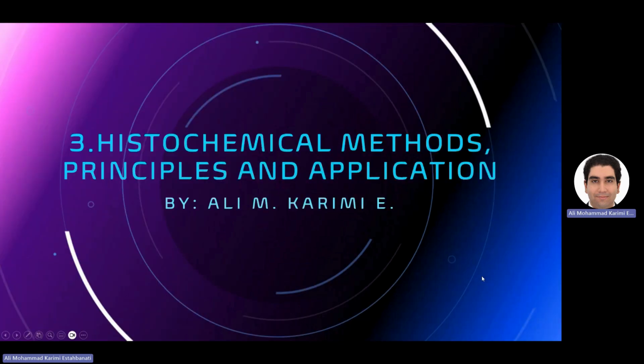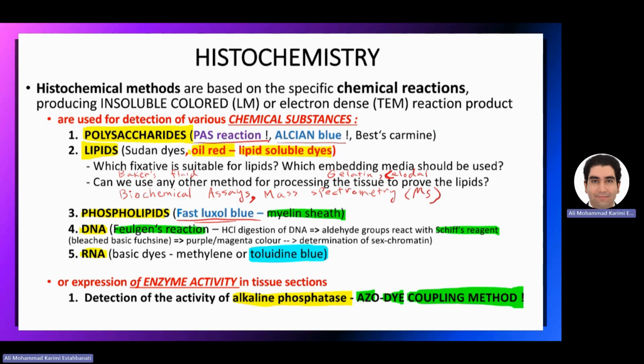Today's session is about histochemical methods, principles, and application. The first thing we need to talk about, according to the question, is histochemistry.